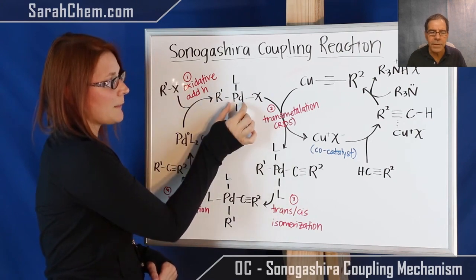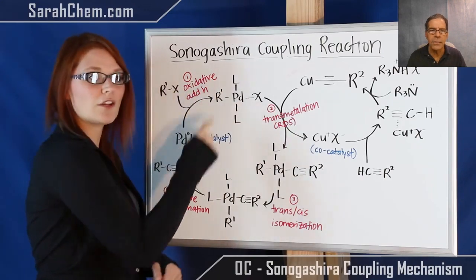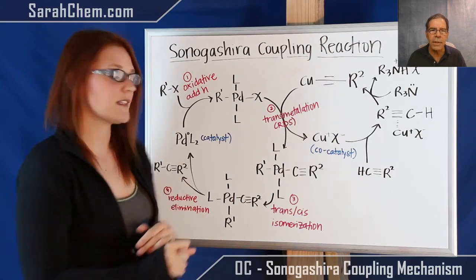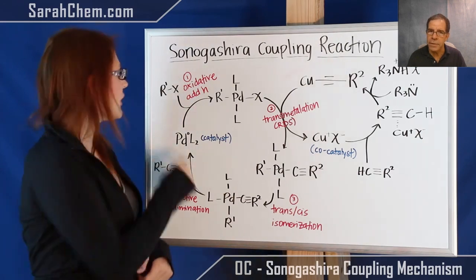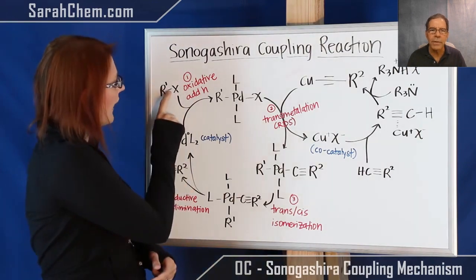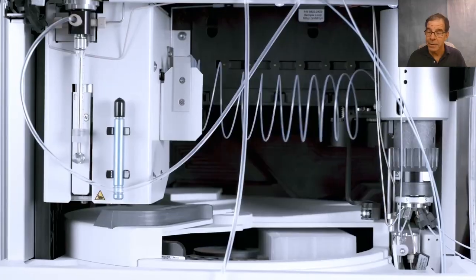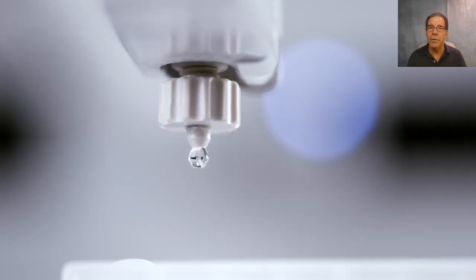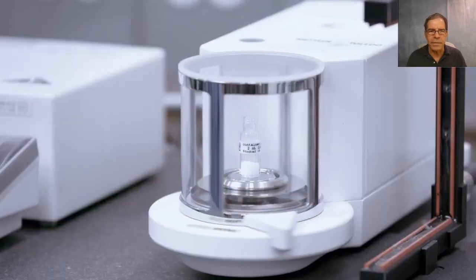To perform its task, Coscientist first researched sites ranging from Wikipedia to American Chemical Society to Royal Society of Chemistry, and also sites containing academic papers. Then, in less than 4 minutes, it designed an accurate procedure for producing the 2010 Nobel Prize-winning reaction. Needless to say, this could revolutionize material science. Pharmaceutical companies, take note. But what is Coscientist?